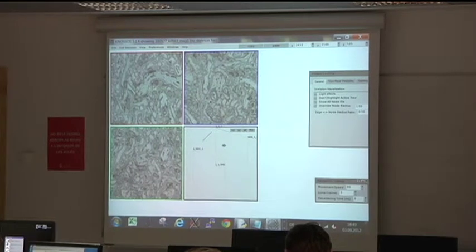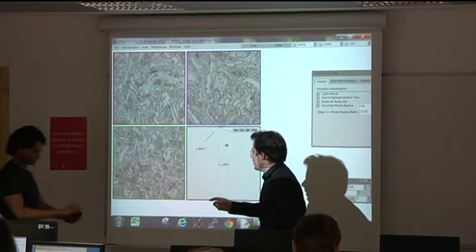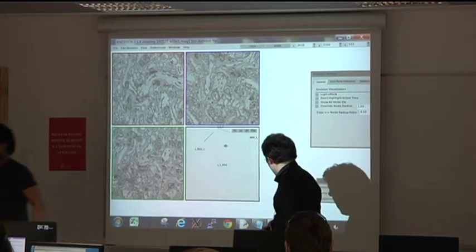So first of all, these are the 3 orthogonal viewports that I told you about. Do you have a pointer? Just a laser pointer, that would be ideal. Thank you so much. Okay, perfect.